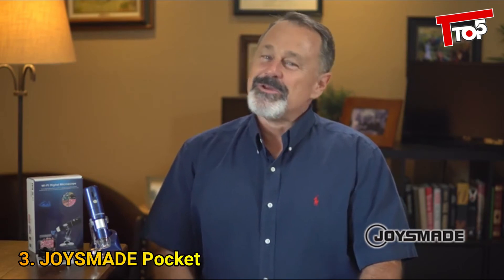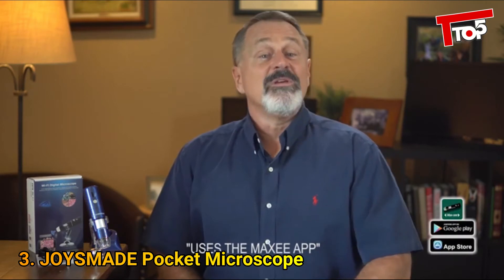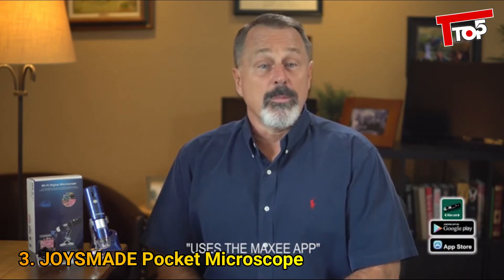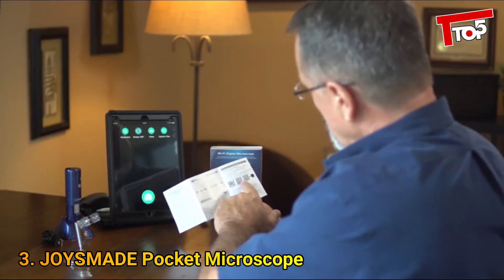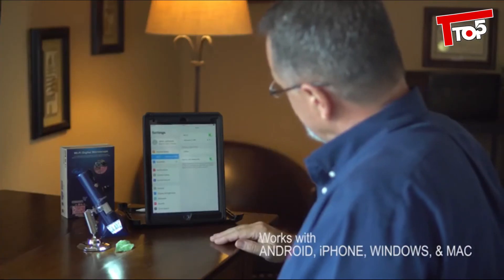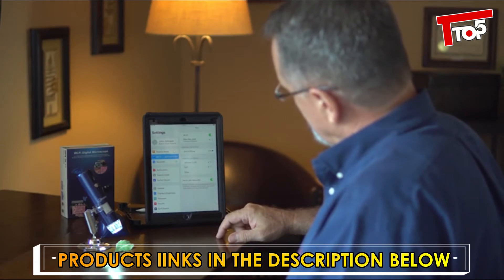It's the Joy's Made wireless USB microscope. Whether you're a kid or an old guy like me, you're going to love this microscope. It works on your phone with a Wi-Fi connection using the Maxi app, which you can download from Google Play or the Apple App Store. Check out the instruction manual for more details. After you have the app installed, the rest is really easy — I'm going to use an iPad, so I'll go to Settings, then to Wi-Fi, and in no time I'm set up and ready to go.